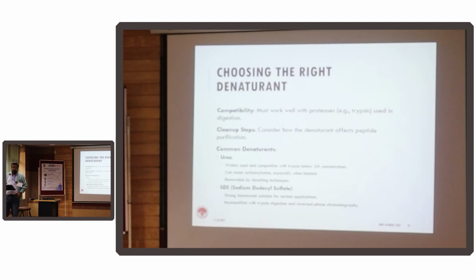There's a very good paper by Professor Hammerstein from Harvard, where he has processed around 1,500 or more human plasma samples. And even sitting at Harvard, he did not have the money to use depletion columns, because each column costs around 14,000 rupees in India. But even at Harvard, in the US, they don't have that kind of insane money.